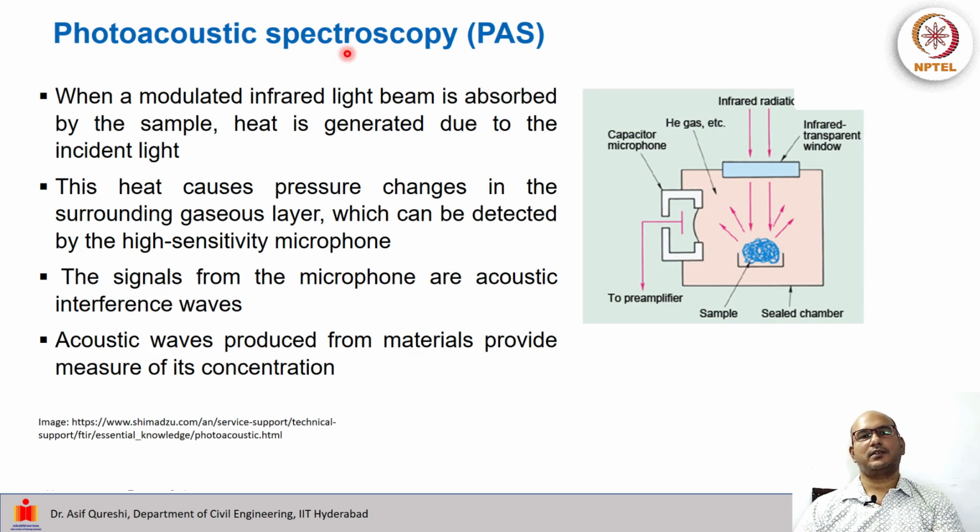We have another method called photoacoustic spectroscopy. The principle is this, that when a modulated infrared light beam is absorbed by the sample, heat is generated due to the incident light. So we have this sample here in a sealed chamber, and we have the infrared light coming in, and we could have some inert helium gas, for example.